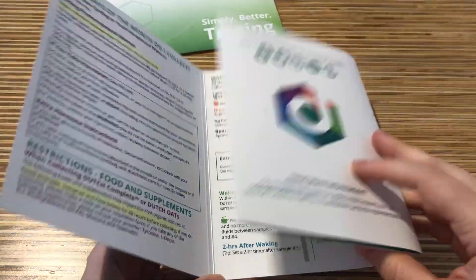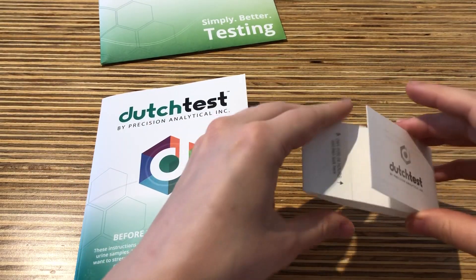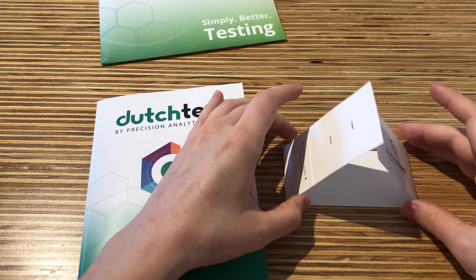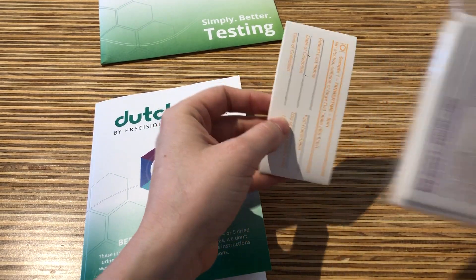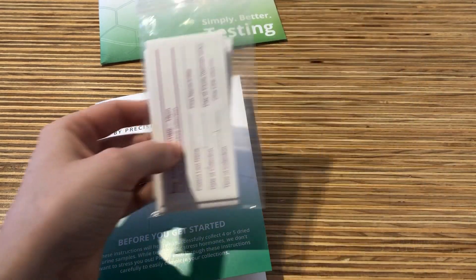Please allow all of your test strips to dry, laying them out flat before putting them back in the Ziploc bag. You will then put all the test strips back in the bag to be mailed off.